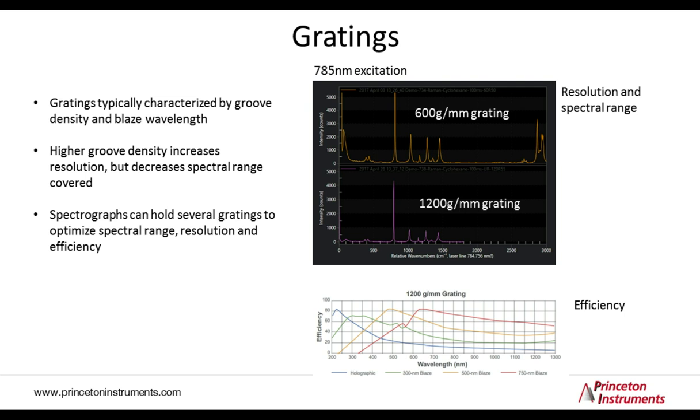The blaze of the grating determines essentially the diffraction efficiency for a given wavelength. It's essential to consider to be able to increase the throughput through the system. The good thing is many spectrographs can hold several gratings to optimize spectral range covered, resolution, and efficiency for different measurement scenarios.